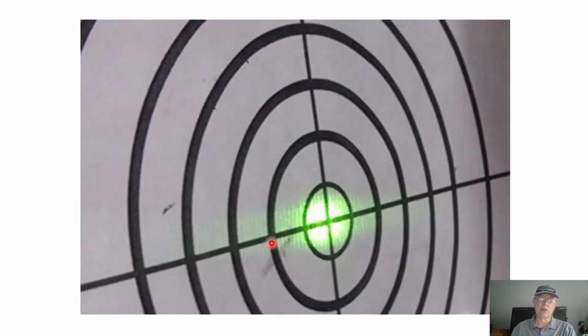And what's going on here, you can see green light. So this is with green laser light illuminating something. And the something that's being illuminated is actually a pin. The light hits a little pin, and that's used to make sure it's going over the center of the apparatus. But what you see off to the side here are these diffraction bands. And this is a good chance to illustrate one of the fundamental things about light scattering, which is that it is an inverse space method.